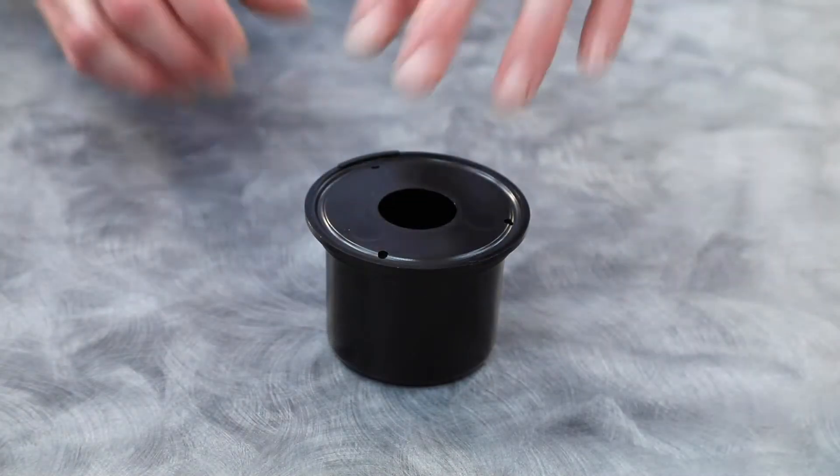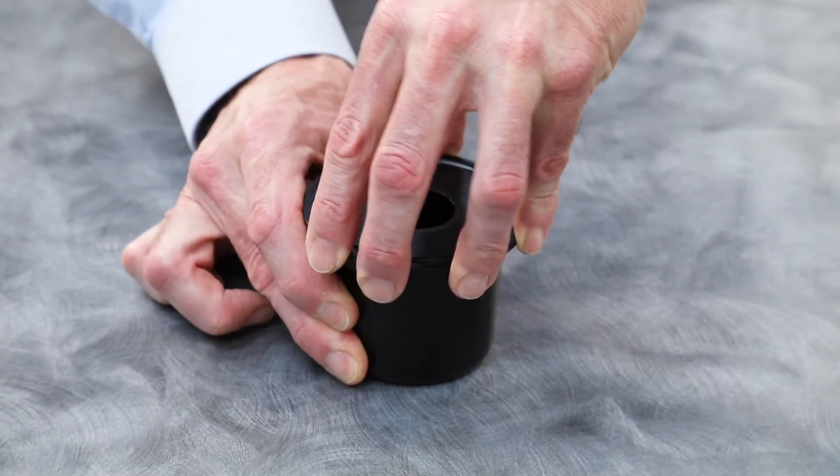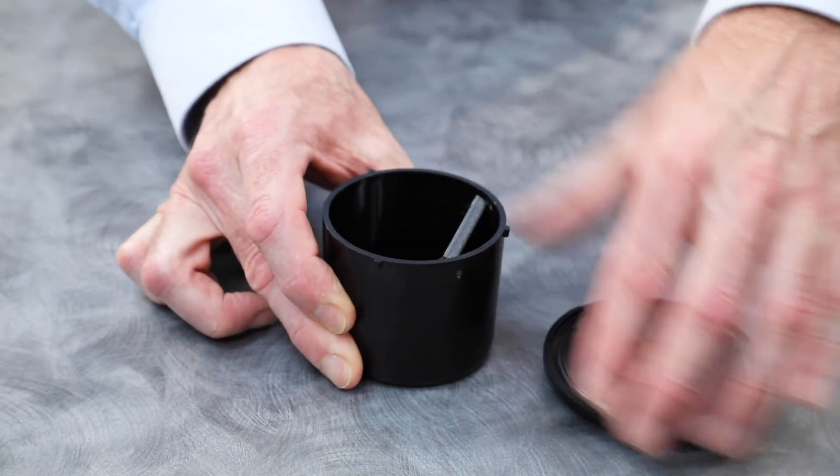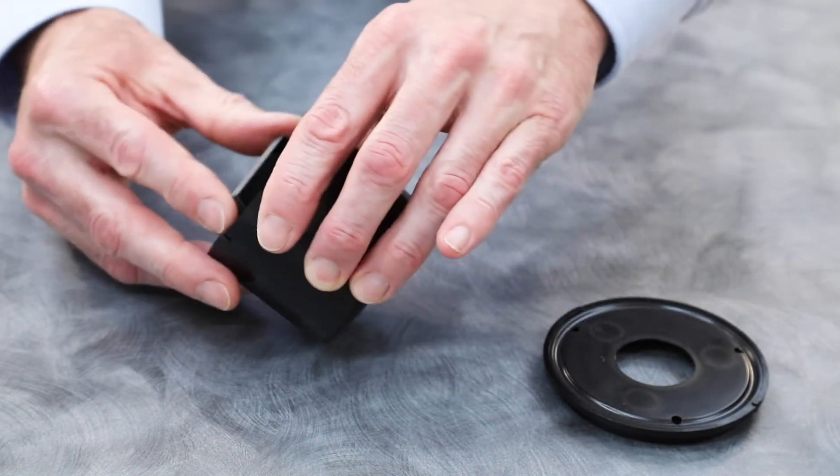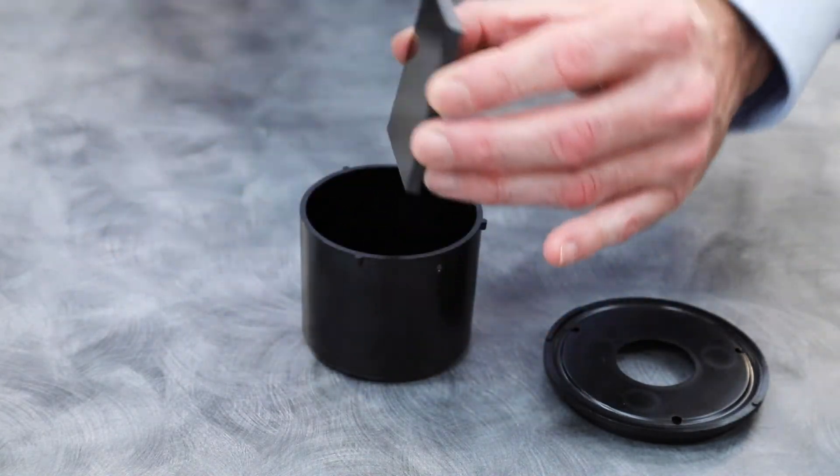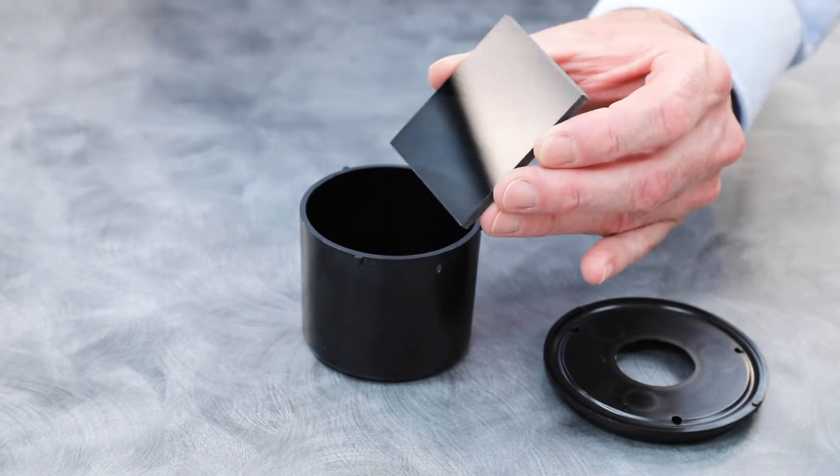To clean the black trap, separate the base from the trap by turning it counter-clockwise and lifting upwards. Carefully remove the trap glass from the trap by holding the edges.